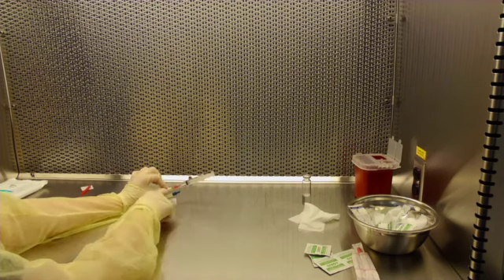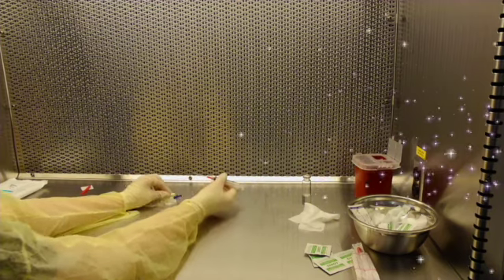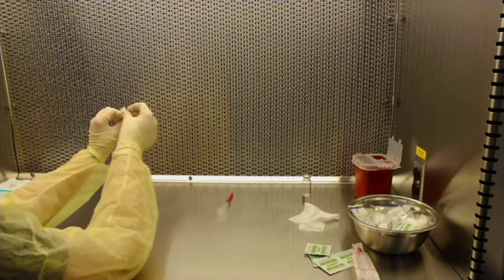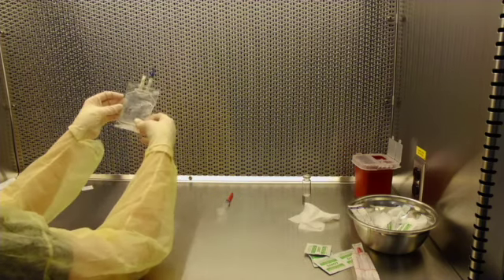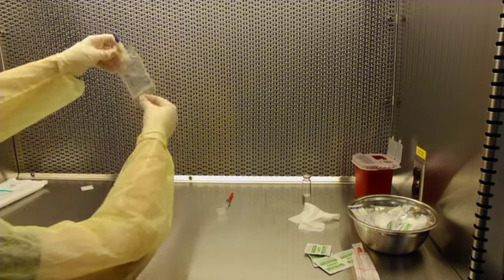You want to pass the inner diaphragms and then depress your plunger. Remove your needle. Safely recap always first. Swab your injection port to remove any drug residue. Pinch your port, give it a little flick. We want to ensure all that drug is in the bag and not pooled in the bottom of our port.